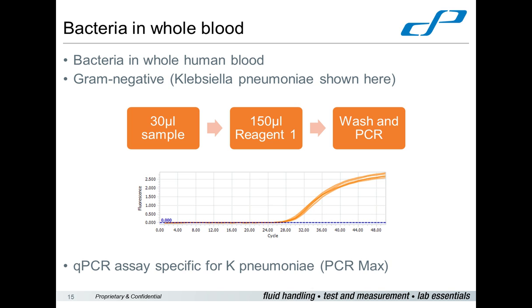As I hinted on the earlier slide, reagent 1 performs a controlled lysis of cells. So it doesn't just blow the cells wide open and completely disrupt the membrane. It actually molecularly punches holes in cell walls. And in fact, in the right conditions, you can use reagent 1 as a transfection reagent to make cells competent. So that might give you some insight into the controlled nature of the lysis step in this kit. It's not simply a detergent going in and wiping out the cell membrane. It's a more complex and more controlled process than that.